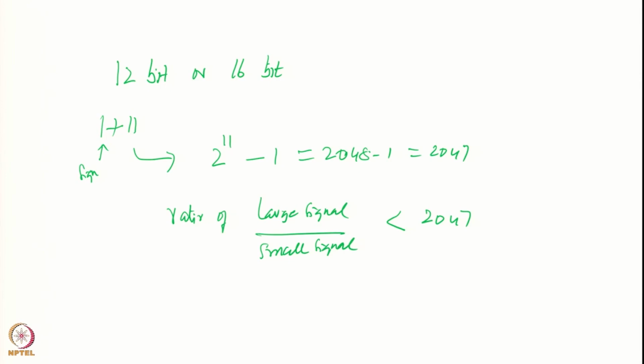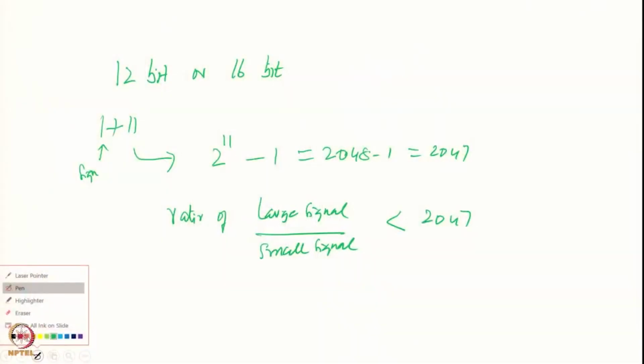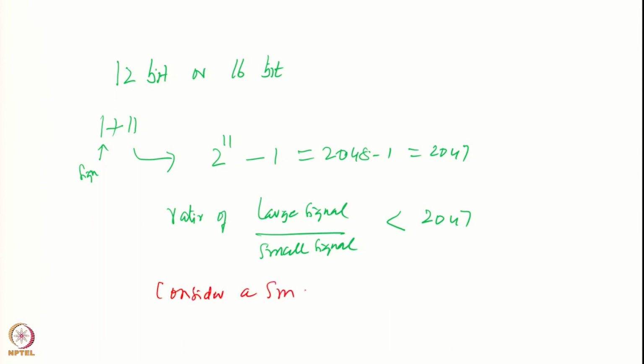and this is where the problem comes. Let us consider that you are collecting a signal in water. Consider a sample in water, and we are recording the proton spectrum. What is the concentration of proton here in water?